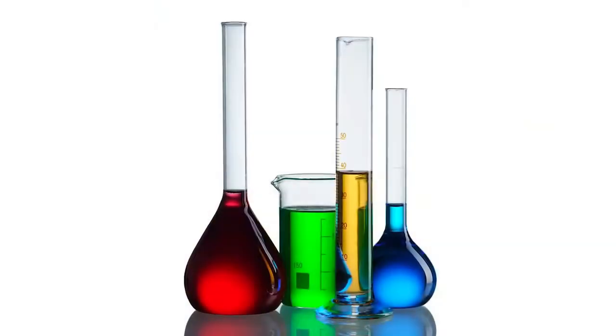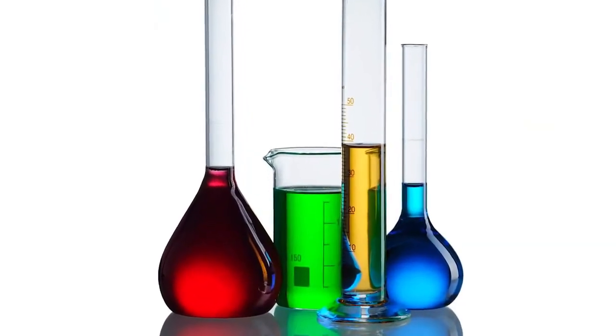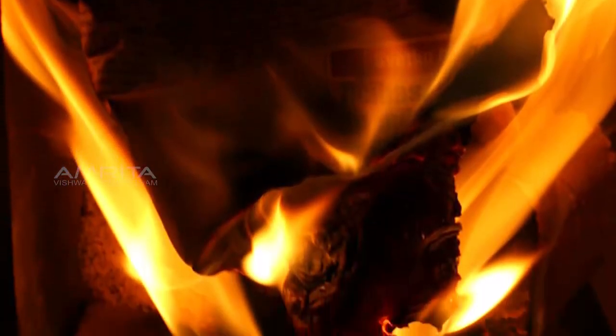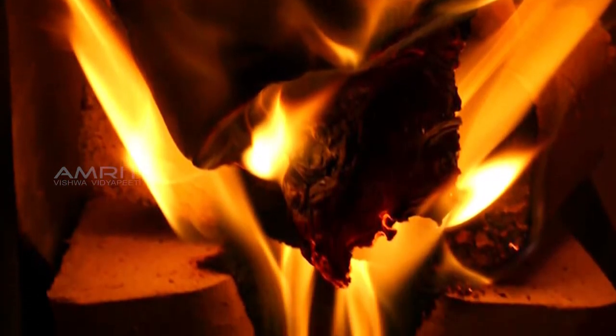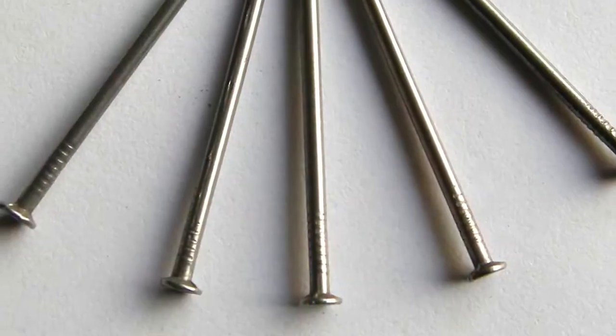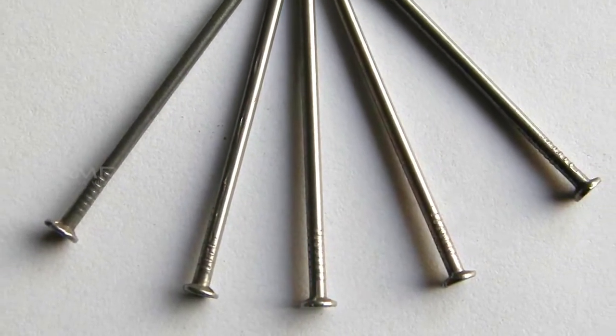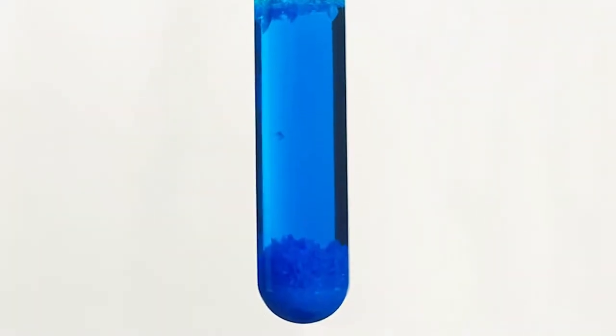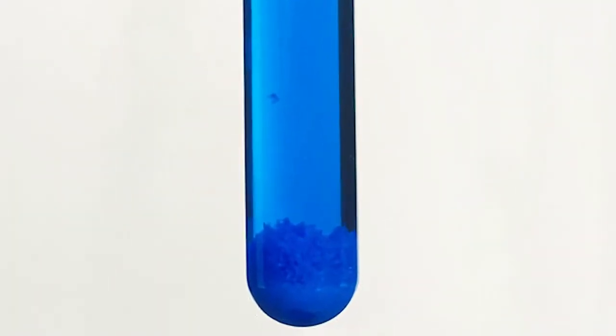A chemical change is a change that creates a new substance. The burning of paper is a good example of a chemical change. The aim of this experiment is to carry out the reaction between an iron nail and copper sulphate solution in water and classify it as a physical or chemical change.